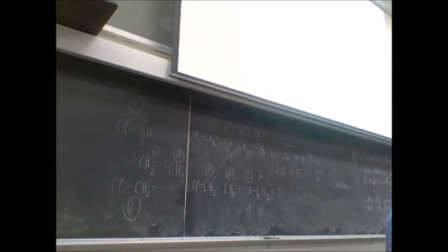So our CH3 is a doublet. That tells us we have one neighbor to the CH3. So this one has 2 neighbors. This CH3 has only 1 neighbor. The other characteristic thing is this peak here, that's our CH2Cl, that's a triplet.